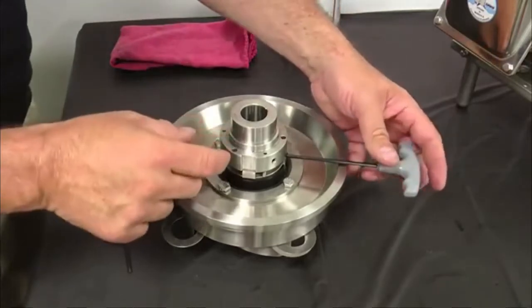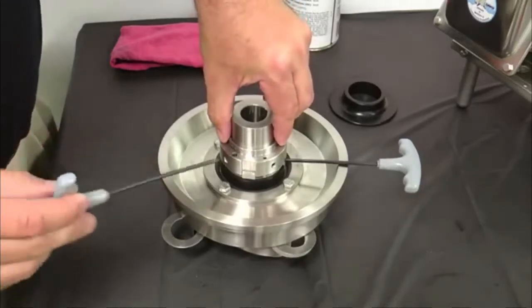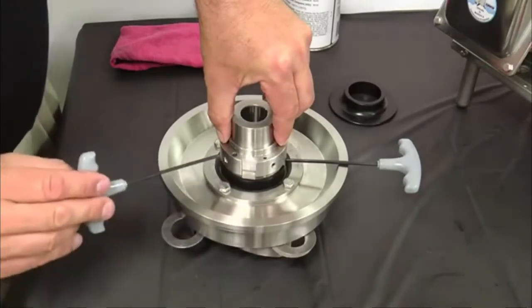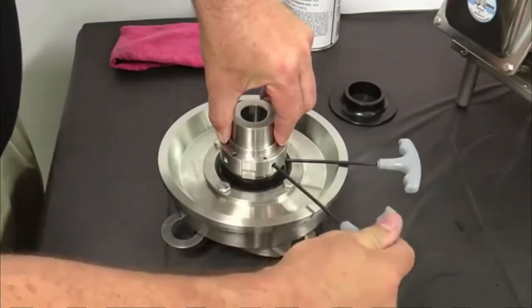Install an eighth inch Allen wrench between the tab washer and the spring retainer for spacing. With the back plate against the impeller, push the spring retainer down to compress the springs until the length of visible spring is approximately one eighth inch. Lock the spring retainer in place by tightening the two set screws with a one eighth inch Allen wrench.